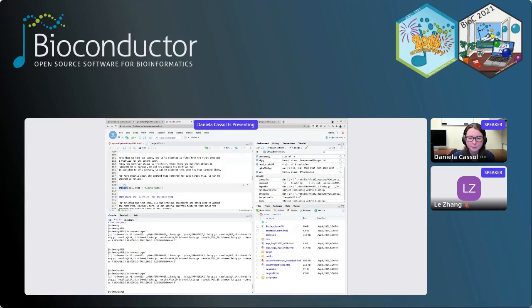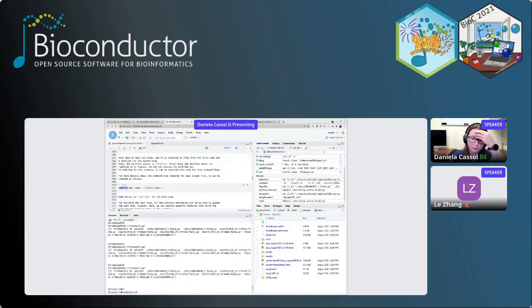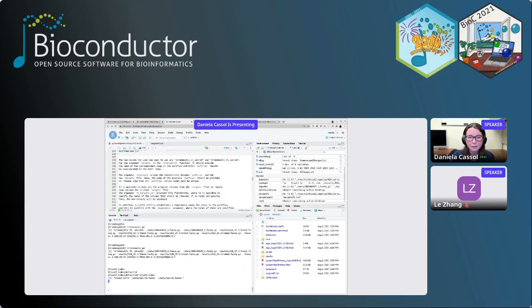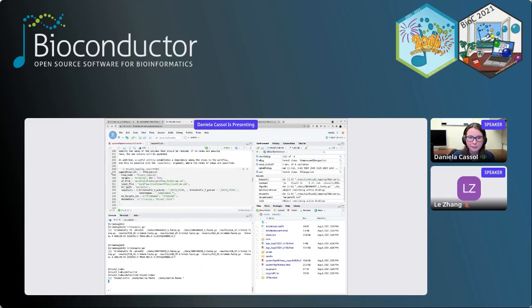So this is also another powerful thing, because you can actually examine everything in your workflow before you run, and then you could avoid any debugging or any error in front here. And then here is for the index. Then you have one step, and then you see here the command line. Okay, so now I'll jump down to line 547.